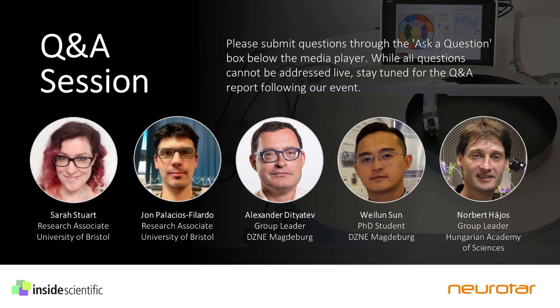Well, this is a very practical question. In our case, we didn't use pre-training in this particular study because there was no behavioral task involved. We did have 3 sessions of habituation. Each habituation was 10 minutes, and after the habituation, we didn't see the animal to be stressed, so this was working for our case.